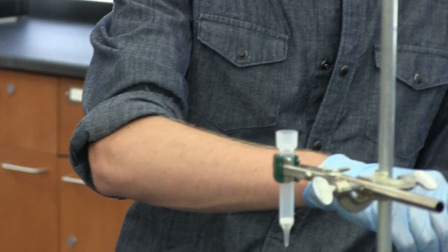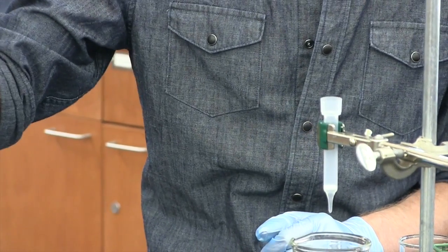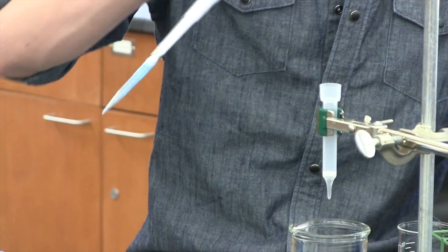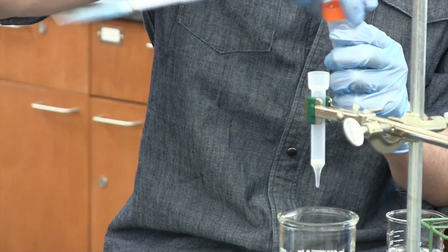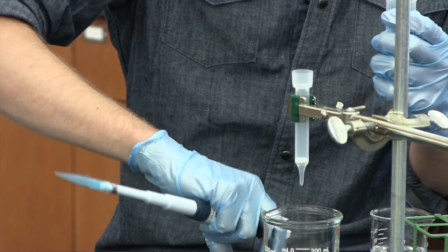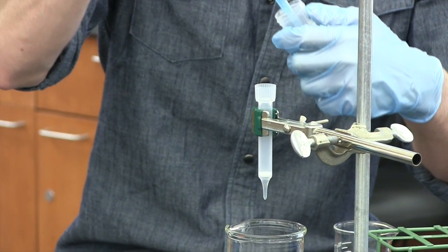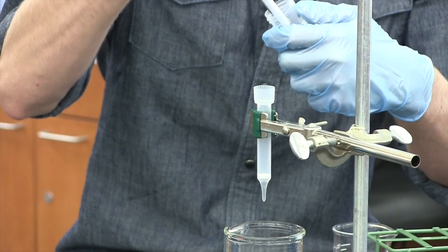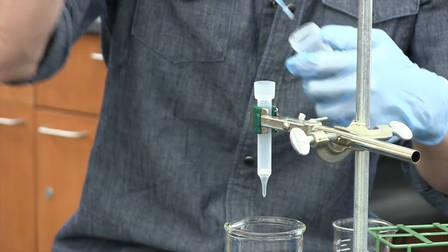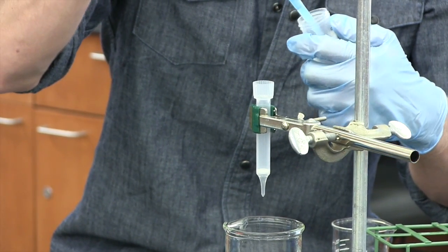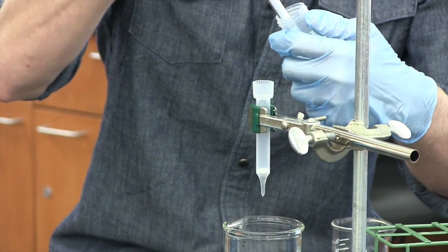You're going to put a mil of that into the column. I like to do it with the cap off, but if you do it that way, you want to make sure you add buffer immediately on top so that it doesn't get dried out. There you can see you got a nice glob of nickel resin, which is okay.